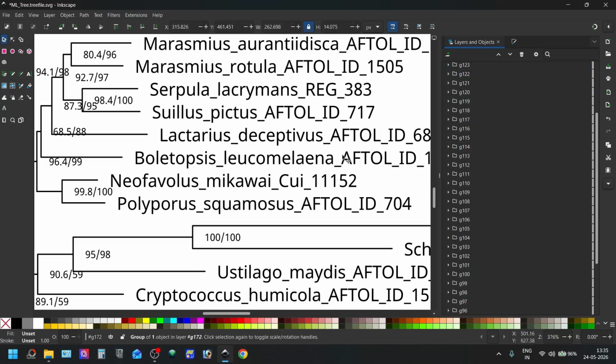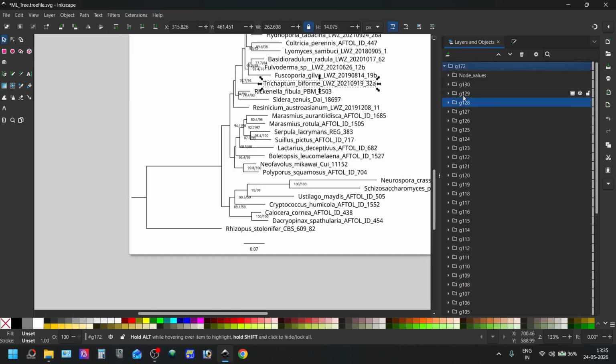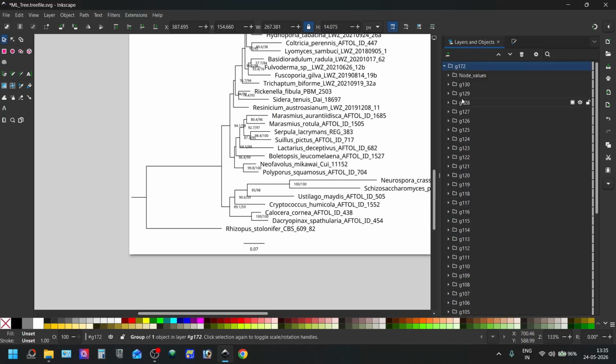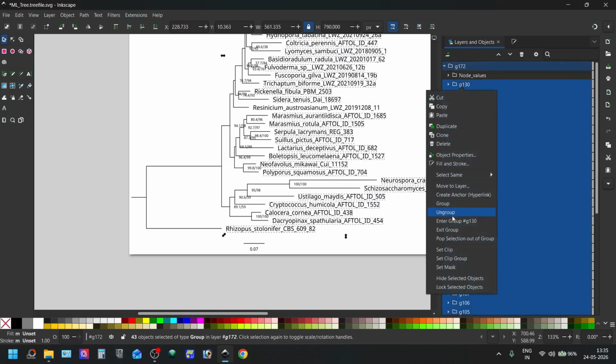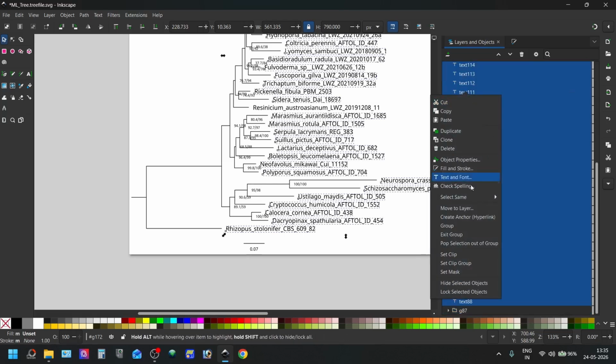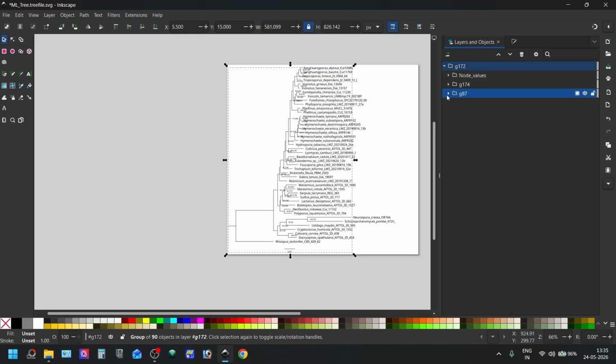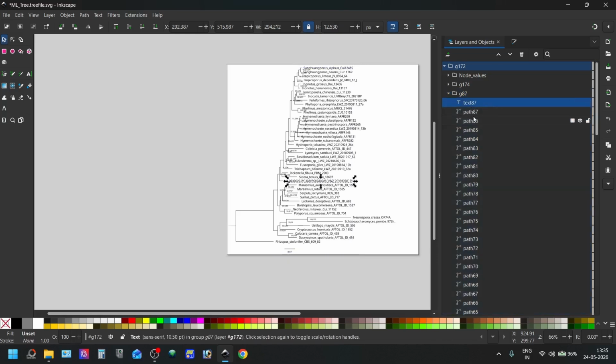And from here we have all these are names, species names up to this. So I'm going to group them together. And another thing is we have one species name here, so we'll keep this one inside this because they are all same types of name. It is species names.